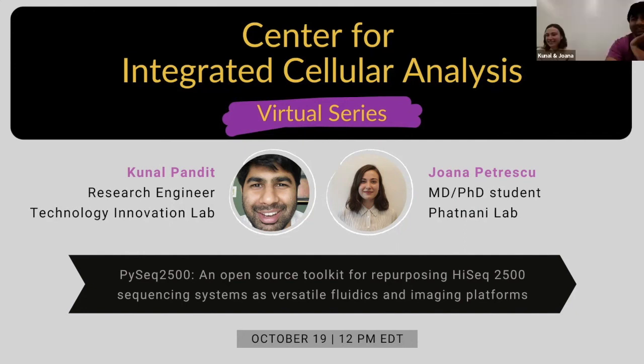So the first thing I'm curious about is, I know, Joana, you mentioned that one of the ideas to repurpose this was to perform 4i in tissue, but can this instrument also be used to stain culture cells? I don't know.